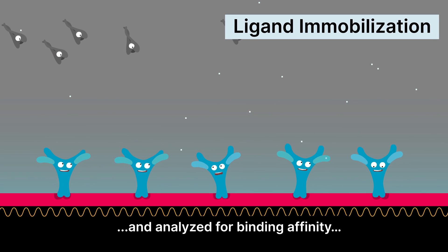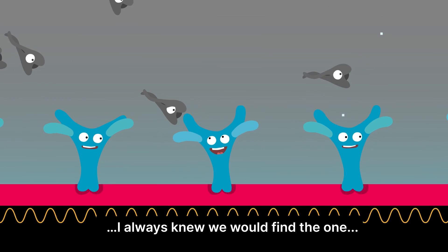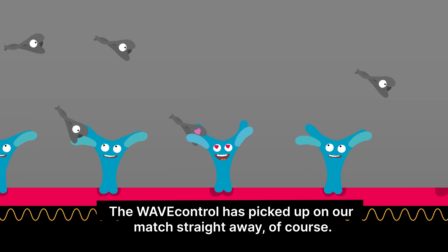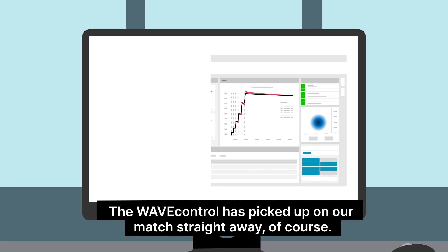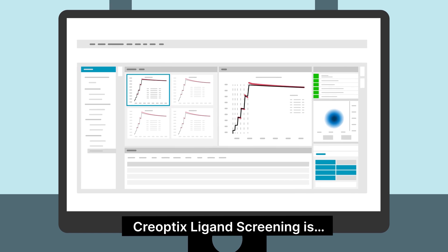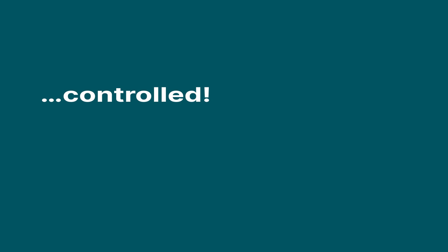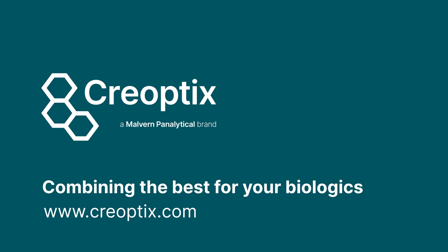And analyzed for binding affinity. I always knew we would find the one. We are true tight binders. The wave control has picked up on our match straight away, of course. Creoptix's ligand screening is easy to use, fast, and controlled. To learn more, visit us at Creoptix.com.